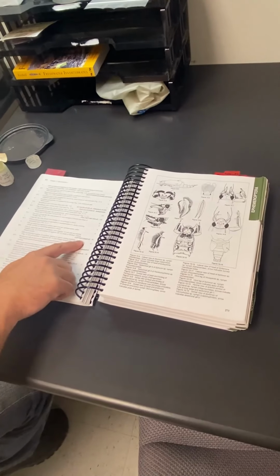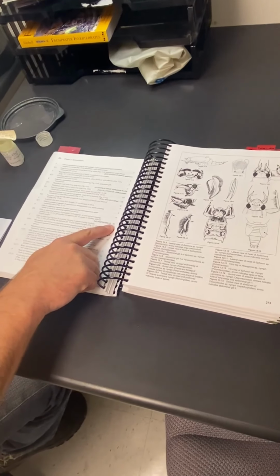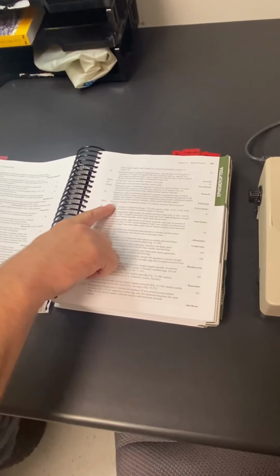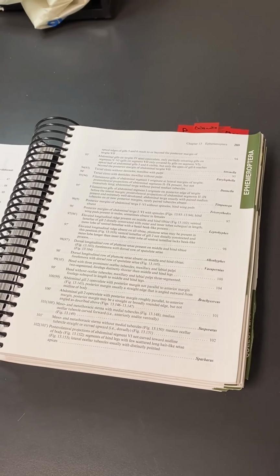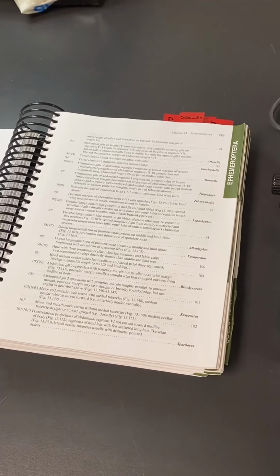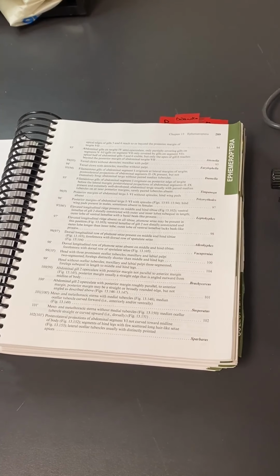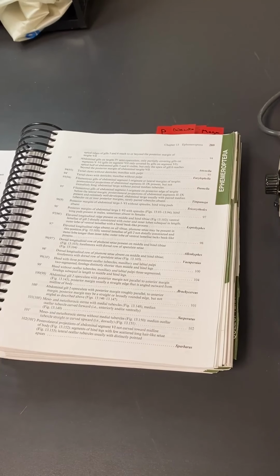So one of our bugs is the Leptohyphidae that we have on the screen. When it tells you to go to couplet 96, you have to go all the way to 96, which is right here. And you'll do this, and then you'll start again. So it's kind of like a flow chart. Yes, you flow until you find out it's a yes or no, and then you go on to something else if it isn't a match for the one that you pulled out. Each couplet has a description of what you're looking for under the microscope, and it gets more and more specific. It narrows it down until you've come out to a specific genus or family.